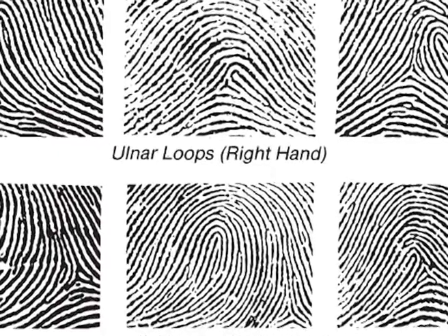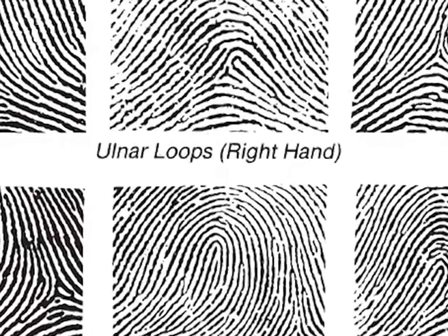Next, moving on to the assessment of the silver nitrate method. As with other chemical methods of fingerprint detection, the silver nitrate technique has both advantages and disadvantages. The major advantage of this method is that the chloride ions in latent fingerprints are non-volatile, and therefore fingerprints which are almost 1 week old may be developed by silver nitrate reagent.